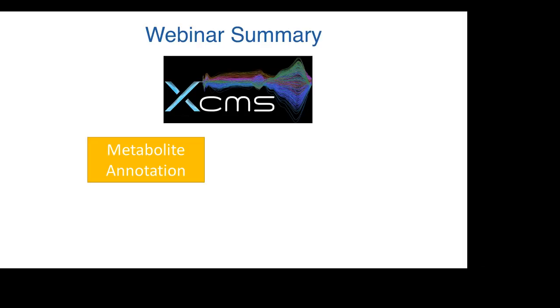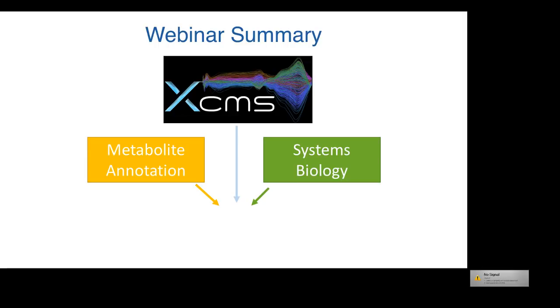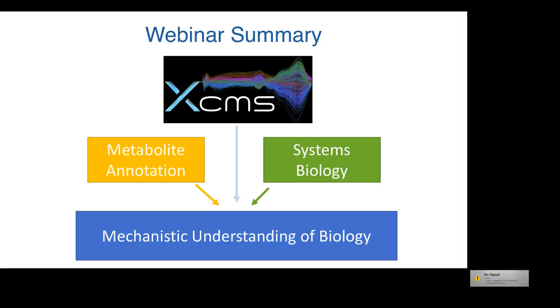Paul introduced us to the platform and really how to get going with your XCMS jobs. Xavier enlightened us on how all of our different new types of metabolite annotations and these pipelines are making metabolomics approachable for all of us. Thank you, Xavier. I'm not a computational person, so I greatly appreciate those. And I hope you found our applications within systems biology interesting and really starting to see how metabolomics has become a robust technology that lets us pinpoint mechanistic understanding. And that's all.